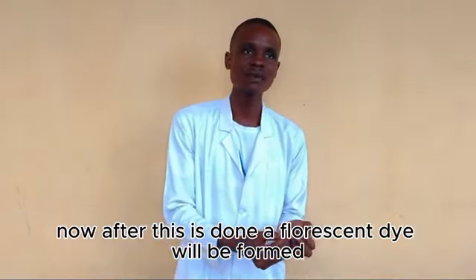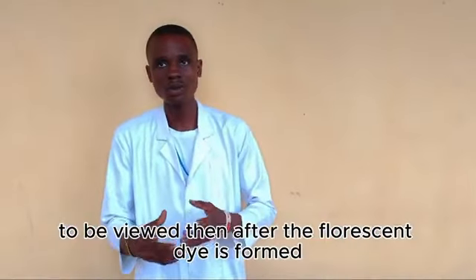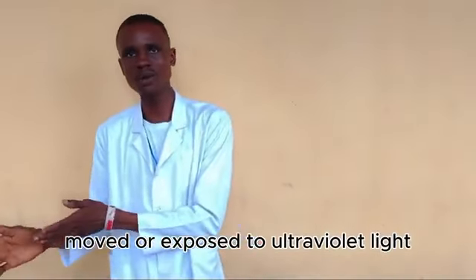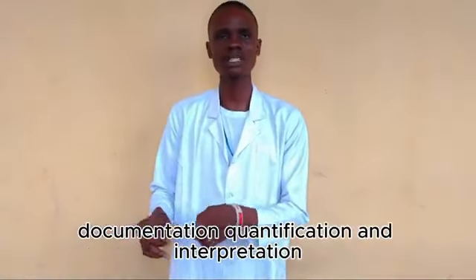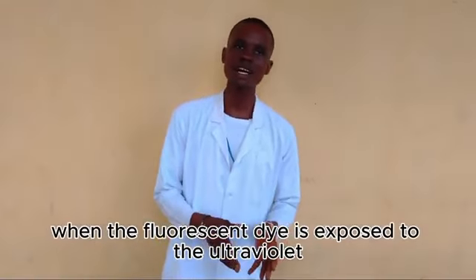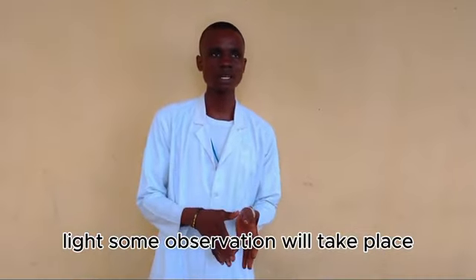The TAE helps the ethidium bromide to intercalate fast, and as this is done, a fluorescent dye is formed, which allows the DNA to be resolved, that is, to be viewed. After the fluorescent dye is formed, it is exposed to ultraviolet light for visualization, documentation, quantification, and interpretation. Now, this takes us to the interpretation. When the fluorescent dye is exposed to the ultraviolet light, some observations will be made which demand interpretation.